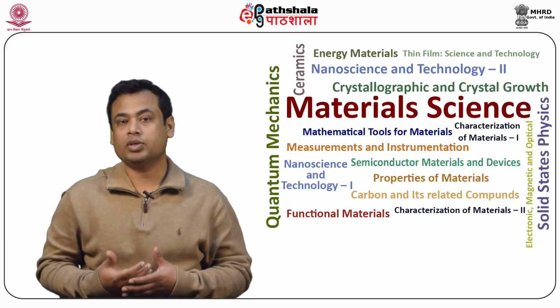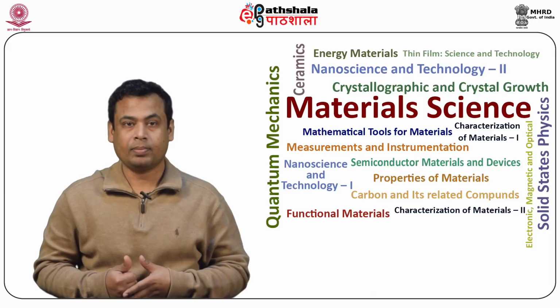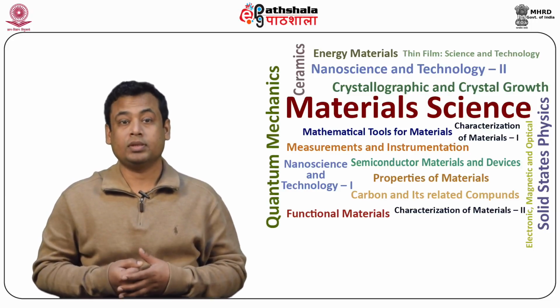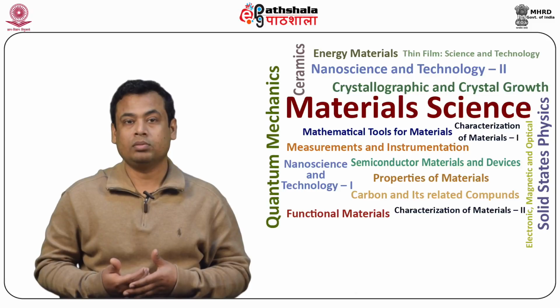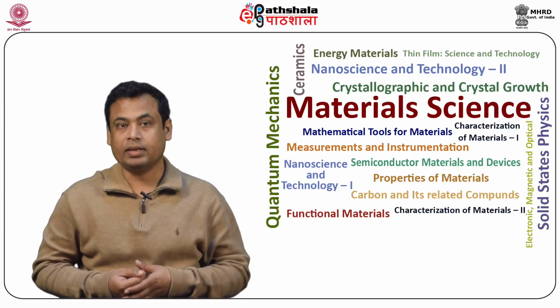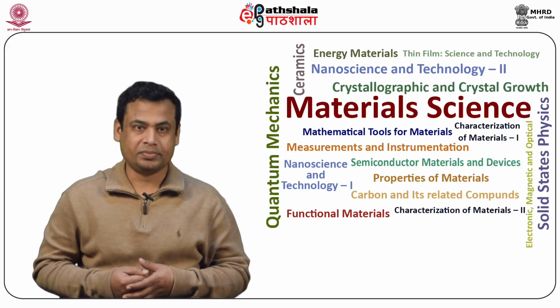Spectrofluorometric methods of analysis are among the most common analytical techniques. The ability of the instrumentation, the simplicity of the procedure, sensitivity, selectivity, precision, accuracy, and speed of the technique still make the spectrofluorometric methods attractive.